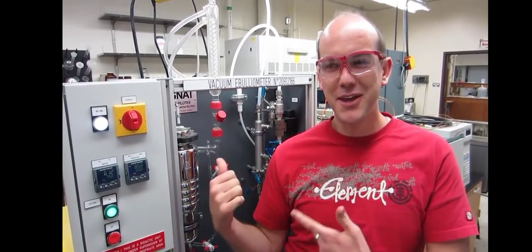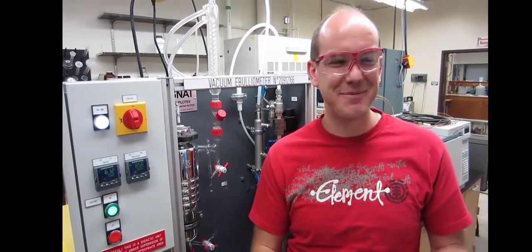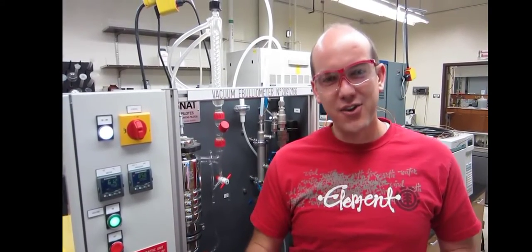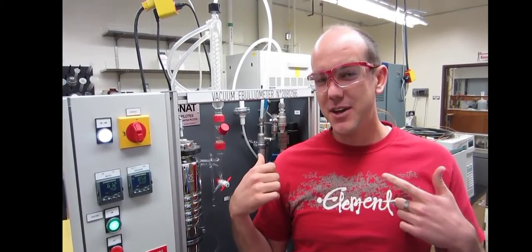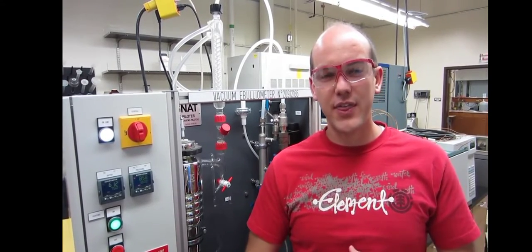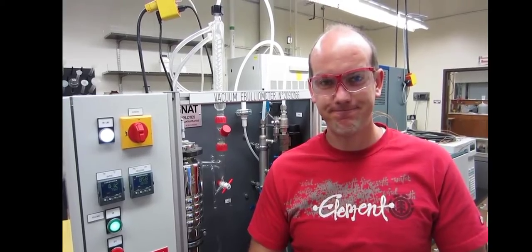Okay, here we got the ebulliometer. It's generally used to measure the alcohol content in wine. But we're not going to do that in ULab. What we're doing is we're using it to measure the vapor liquid equilibrium data for ethanol and cyclohexane.